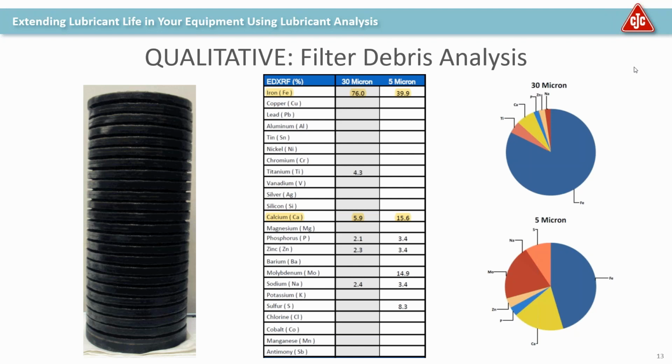On average, we would say the water content is very low in, for instance, wind turbine gear oils. Looking at over 100,000 installations, typically the water content is below 100 ppm, anywhere from 100 to 200. There are cases, though, where certain oils are more hygroscopic and will show through Karl Fischer analysis that you can have 500 to 1,000 parts per million, but no free water. So that's more related to the oil formulation.